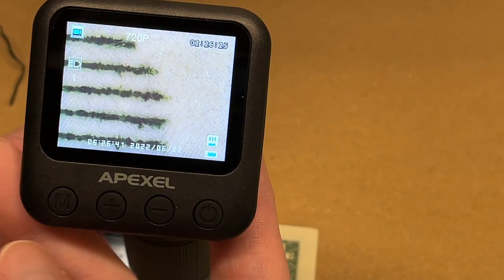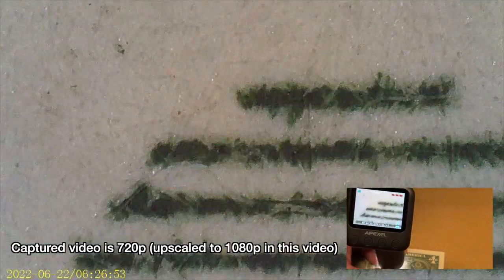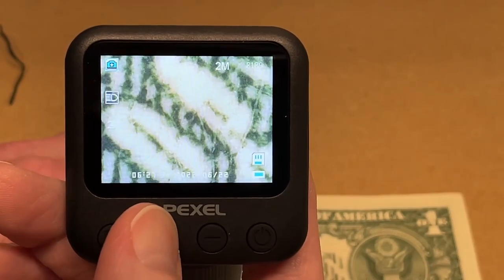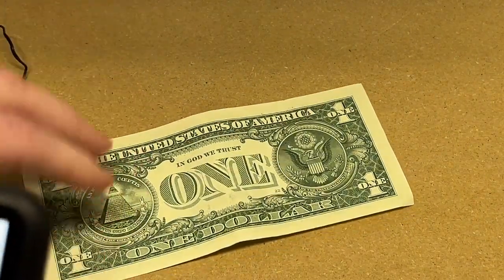I'll start out with a dollar bill. I'll put it on here. I can adjust this and move it around so we can see the different parts. We can also do video — let me start recording. Here we can see the words on it. What you were just watching was the video pulled from this device. We can zoom in a little bit. That's a dollar bill — you might look at that just to see what's on it. It's kind of a fun thing to do.